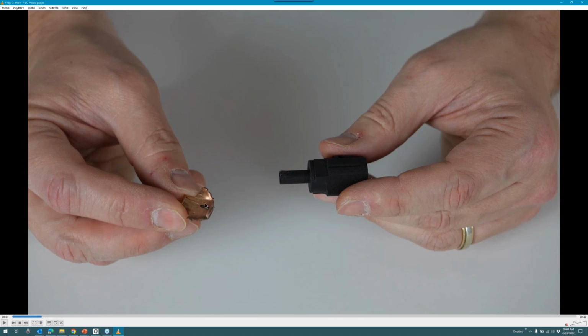And that becomes important because the midpoint of that region, which is essentially the middle of that land engraved area in this scenario, I want to bisect that with an imaginary line from that dash. I want that to cut straight through the midpoint of the region I intend to acquire.